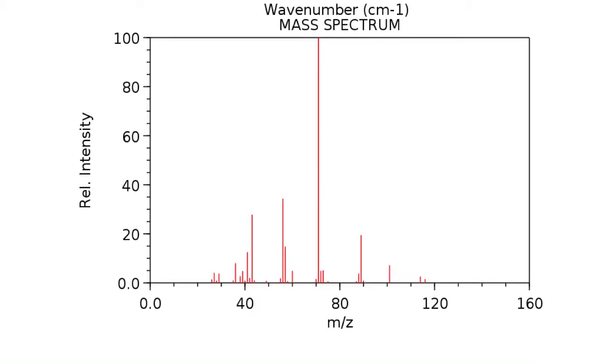So the most intense appears to be, what is it, 60, 71, 40, 43, 50, I don't really know which one it is, 57, okay, or 58.